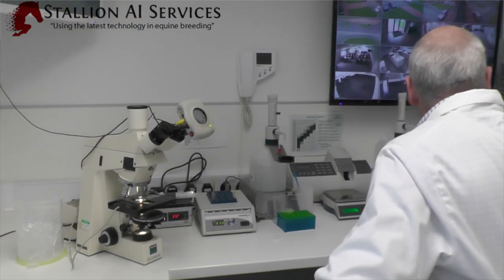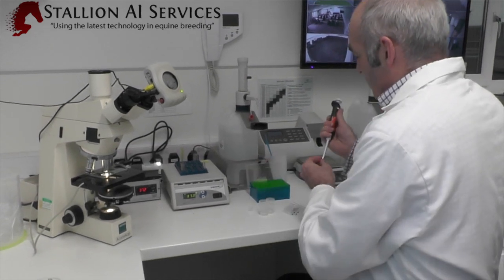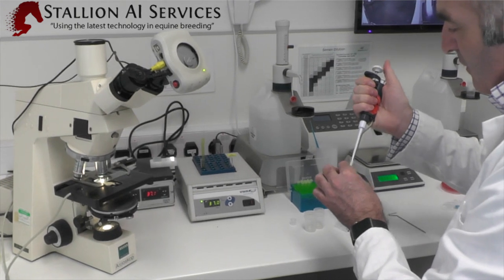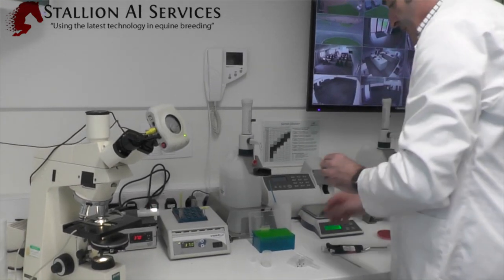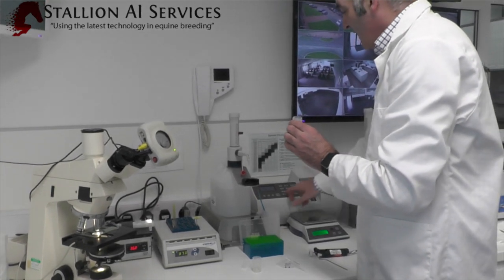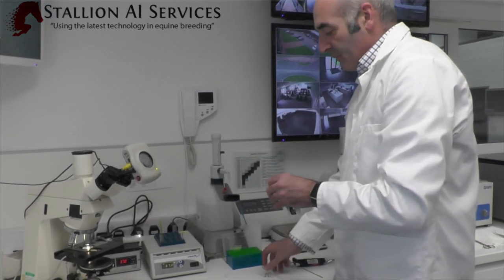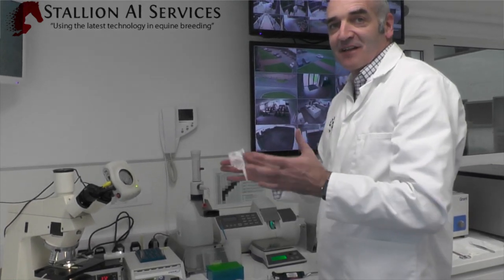The other thing we've got to look at is the viability, and we also want to double-check the concentration. We take a 50 microlitre pipette, take a sample of semen, and put it into our tubes. We add a solution that breaks down the cell to just expose the nucleus, put it in a cuvette where there's a stain, and this tells us exactly how many millions of sperm there are per mil. We do another stain for the second measurement — this permeates cells where the membrane is ruptured and broken, telling us how many non-viable sperm there are. When we cross-reference the two, that gives us the viability.